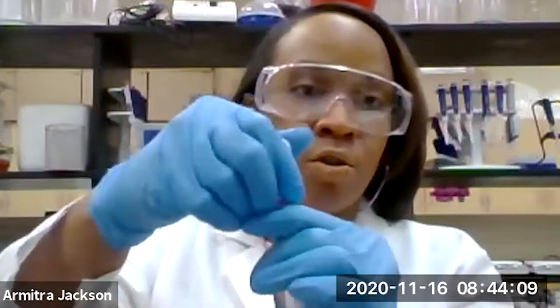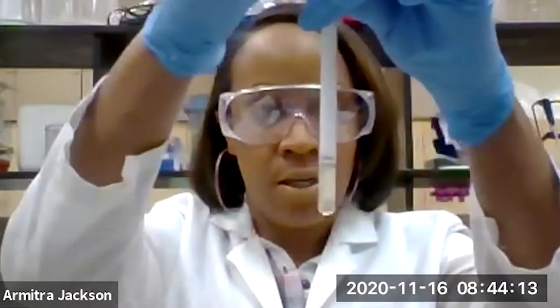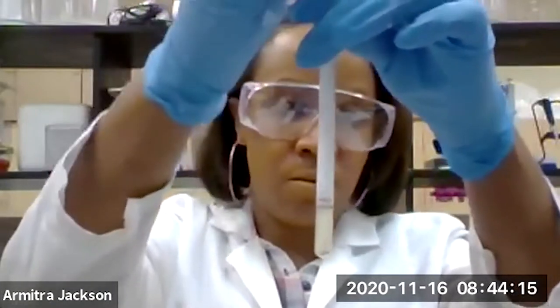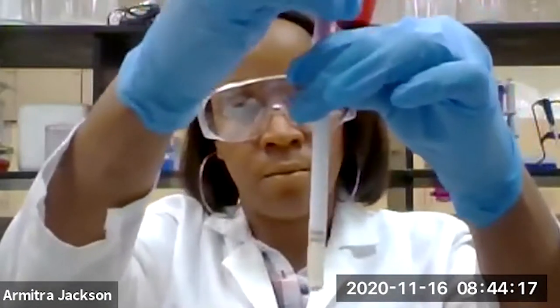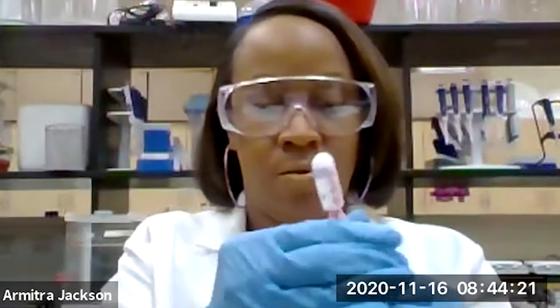I am going to release the media down to the swab, and I'm going to go ahead and take this out so you can see we have our swab there. I am going to sample the floor.